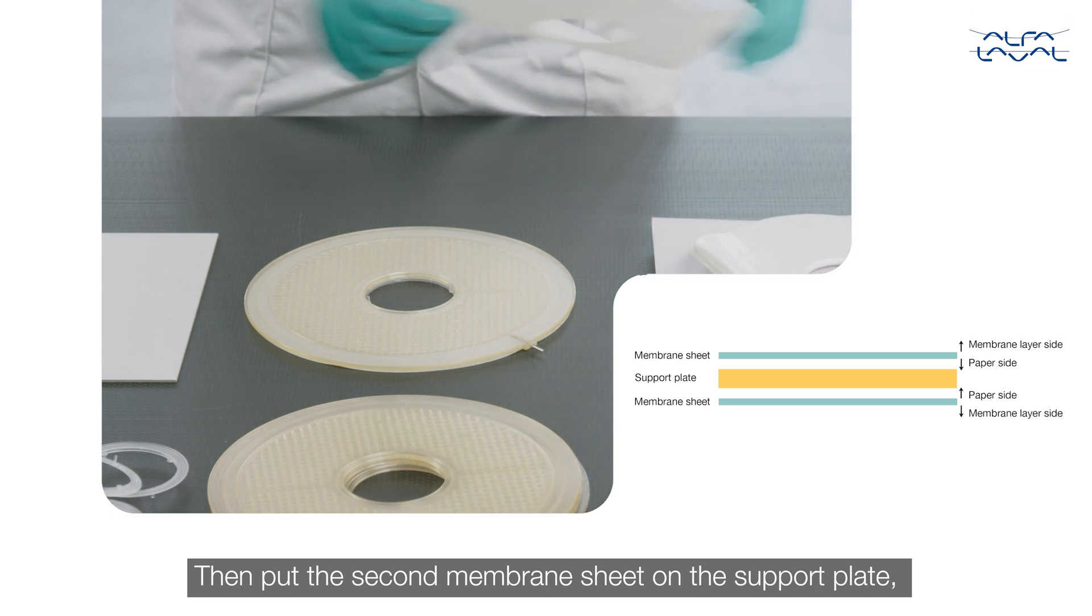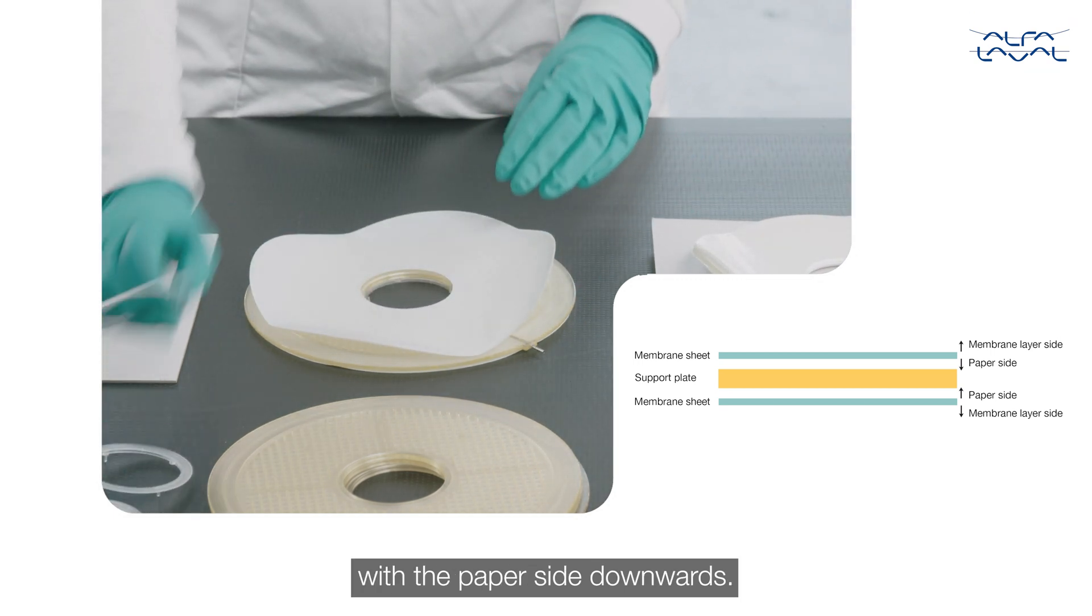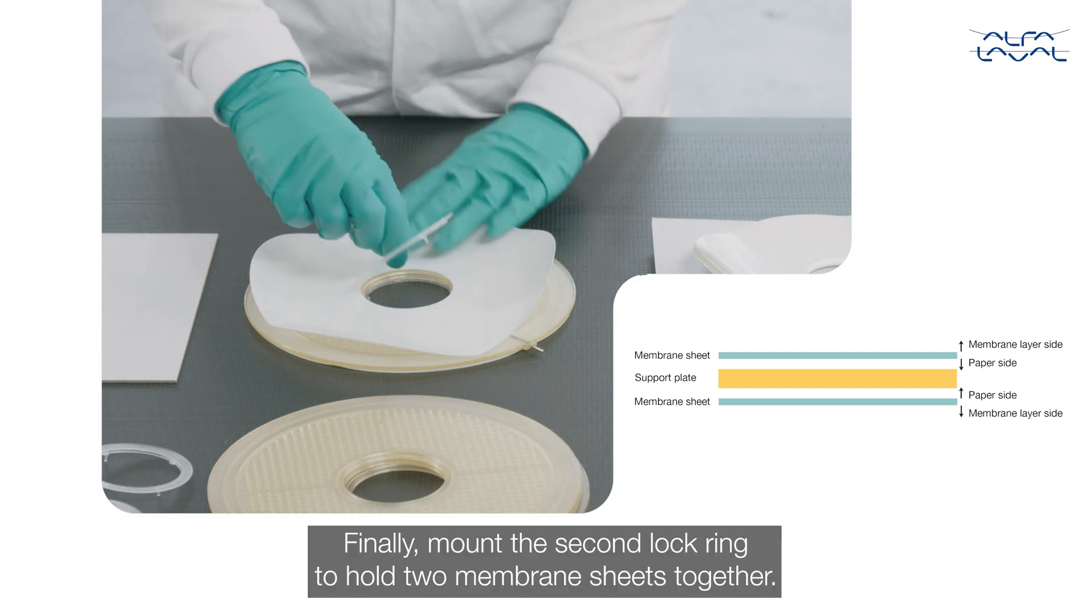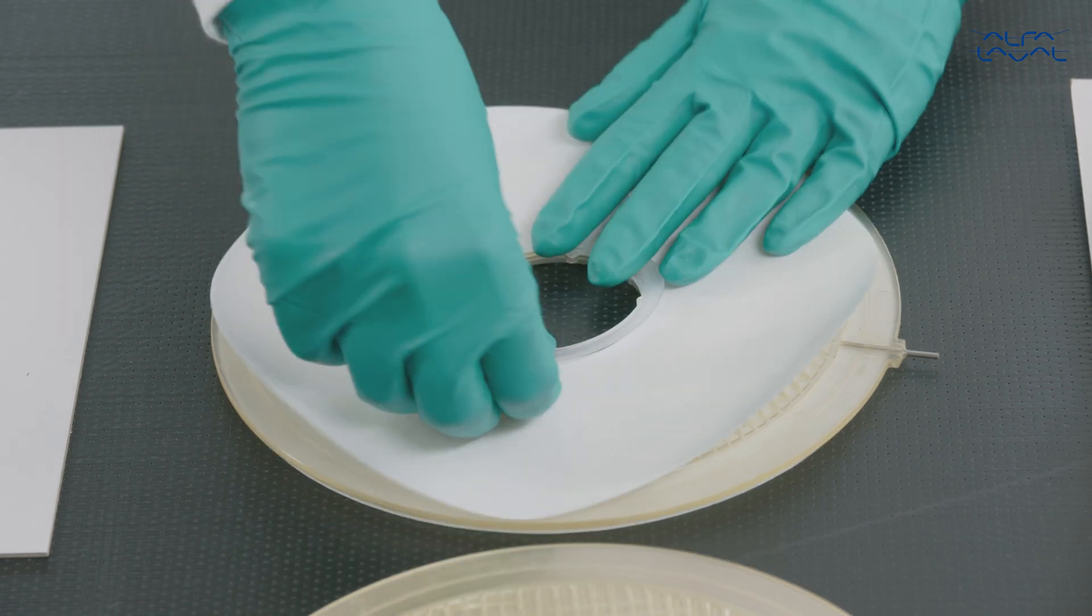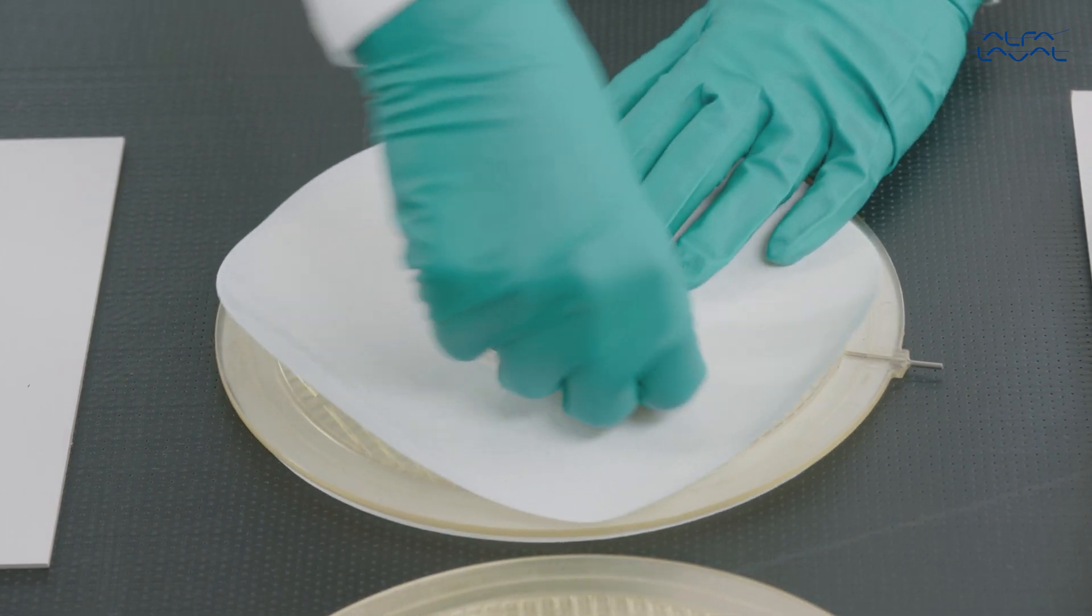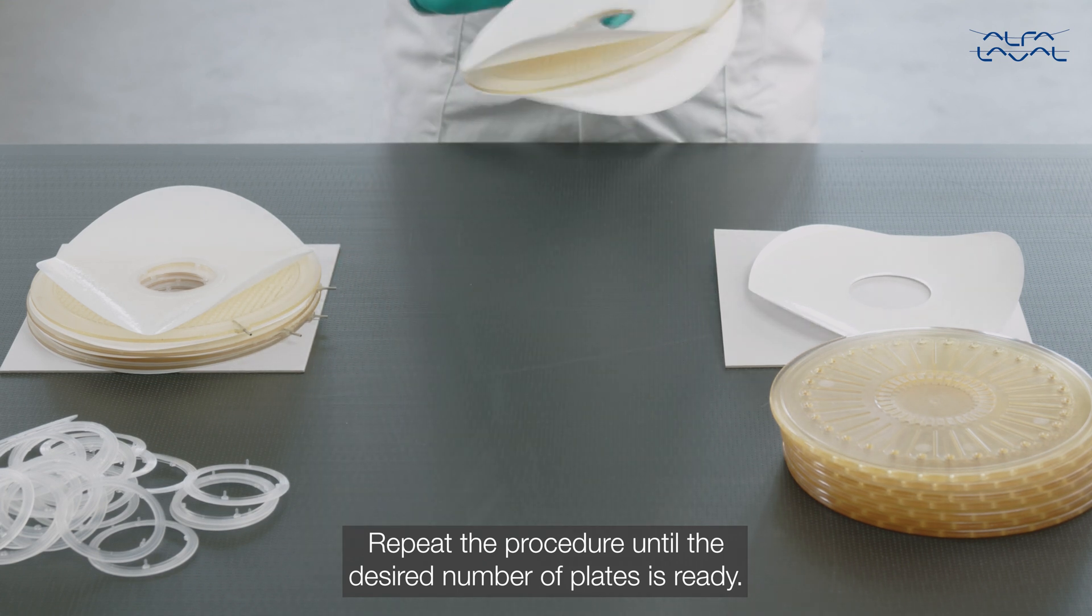Then put the second membrane sheet on the support plate with the paper side downwards. Finally, mount the second lock ring to hold two membrane sheets together. Repeat the procedure until the desired number of plates is ready.